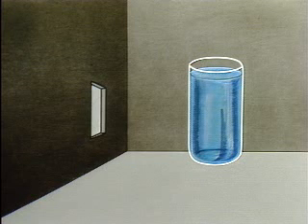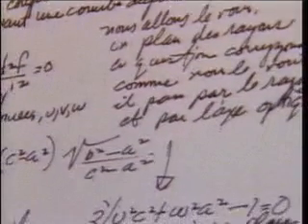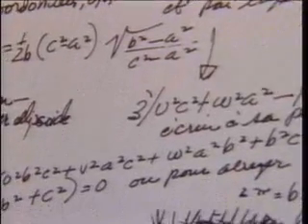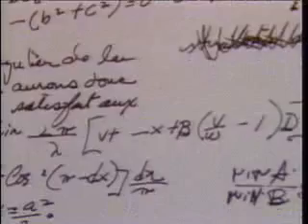Remember that the light passes through only a small section of the solution directly behind the slit. The cell length is the distance the light travels through the solution. Between 1789 and 1852, several noted scientists were involved in formulating a mathematical relationship between absorbance, concentration, and cell length. The resulting equation was one of the first mathematical expressions of a scientific phenomenon.